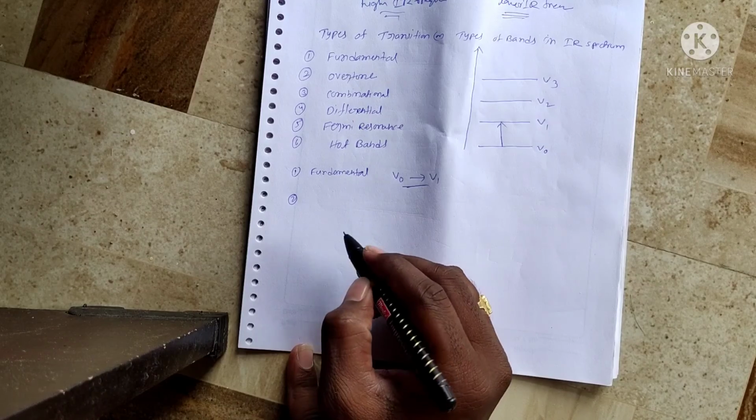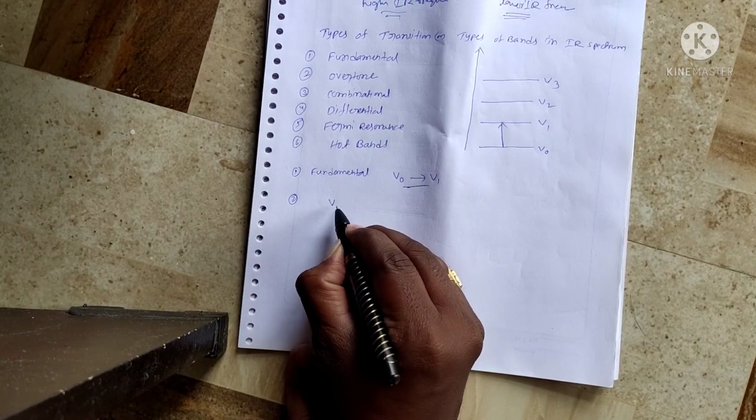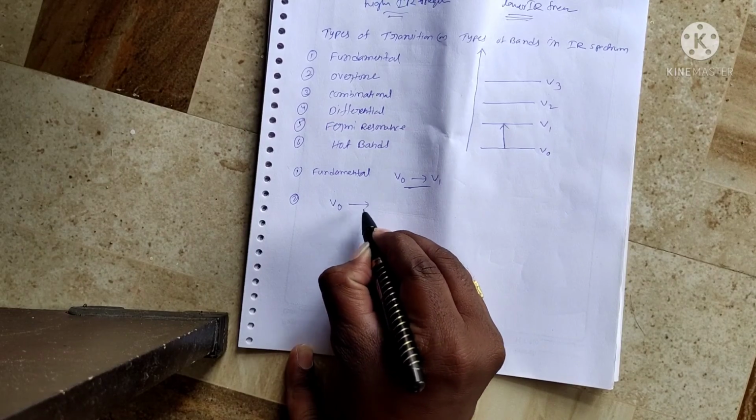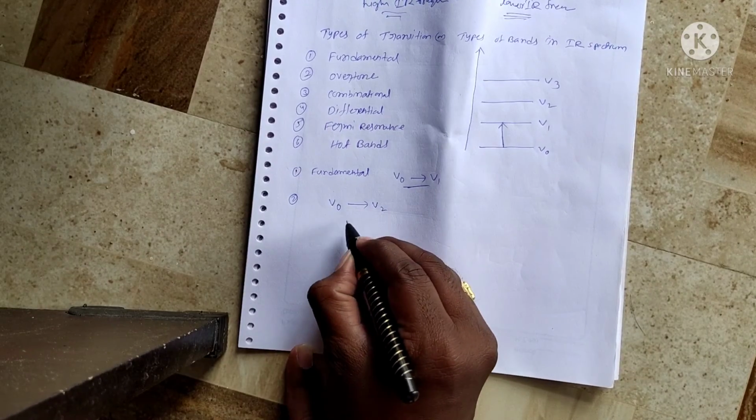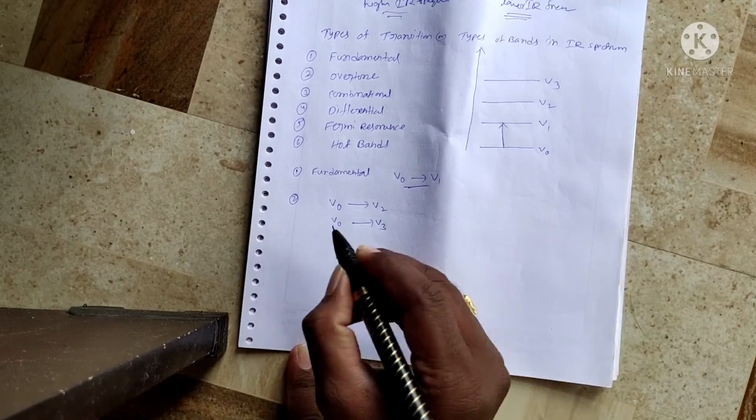The second one is overtone bands. What are overtone bands? V0 to V2 or V0 to V3, like this.